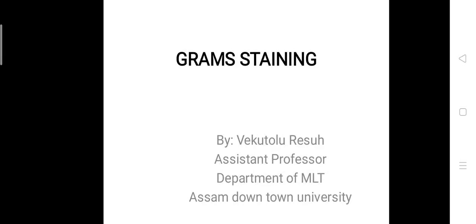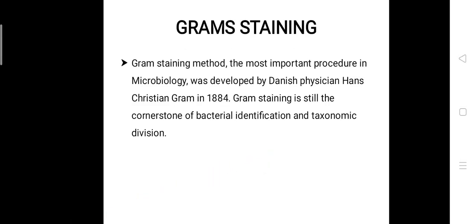Today we are going to be discussing gram staining. This gram staining is one of the most commonly used stains in the microbiology lab, and it was developed by Danish physician Hans Christian Gram in 1884. Gram staining is still the cornerstone of bacterial identification and taxonomic division.